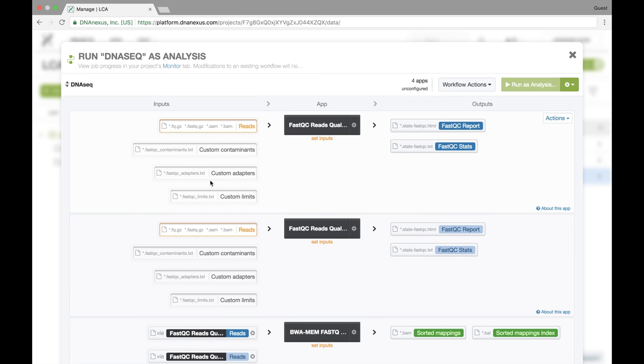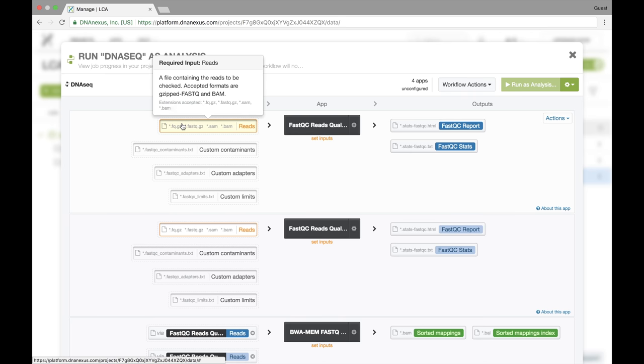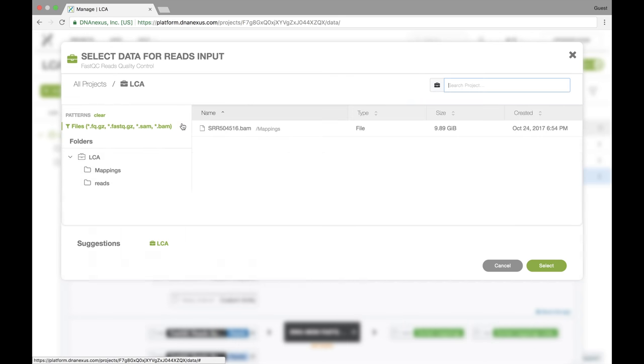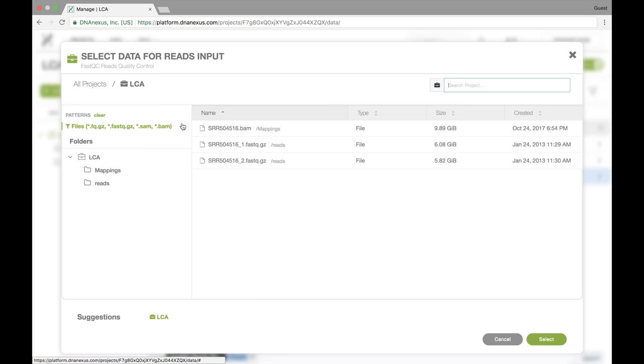Now that we're running the workflow, we can set the actual inputs for each step in the workflow. So now I want to select the forward reads. I do that by again clicking. And now we're in our data selector view. You can see that it's already showing us all files that match the pattern specified by the app developer.